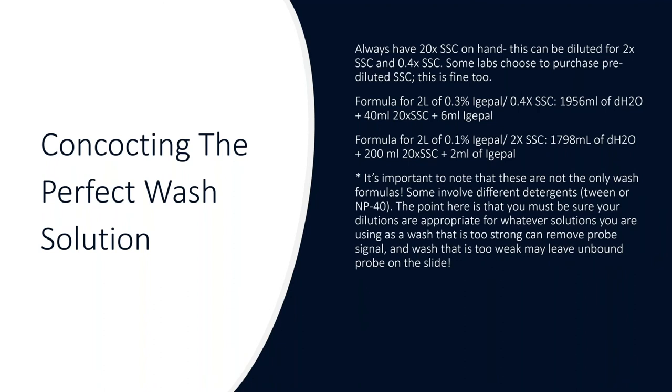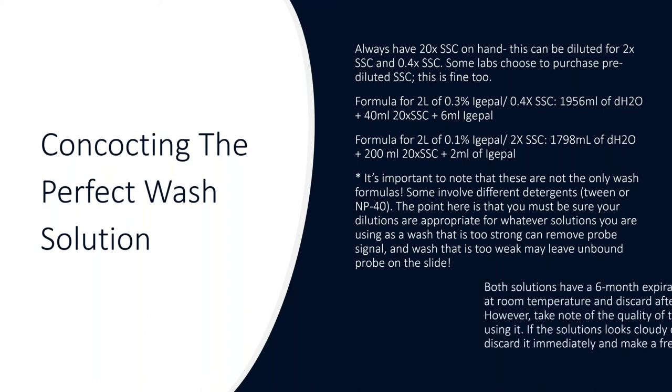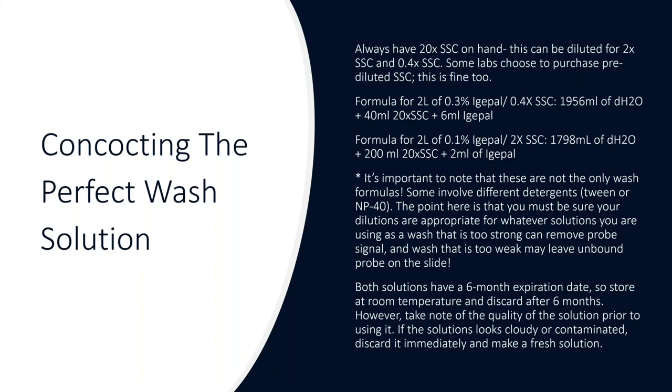These are not the only wash formulas — some involve different detergents — but make sure your dilutions are appropriate, because if the wash is too strong it will remove probe signal, and if too weak you'll have background. Both solutions have a six-month expiration date. Store at room temperature with a cap on, and discard after six months. Also check solution quality before use: if it looks cloudy, contaminated, or has floating debris, discard it immediately and make a fresh batch — it would be awful to lose a whole batch of slides to a poor wash solution.